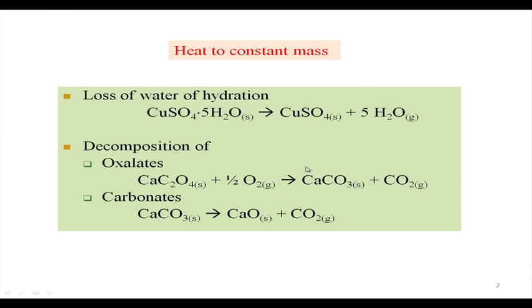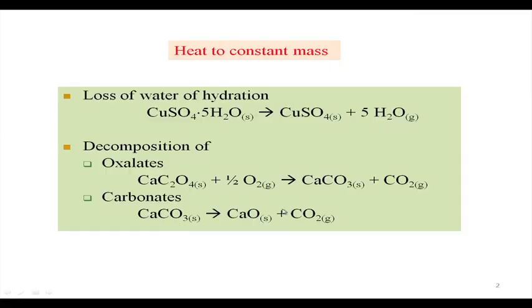This gives a very important piece of information to us, because in detail we will talk in our next class about the degradation not only of calcium oxalate, but of magnesium oxalate also, and that degradation process will also tell us about the stability of these two important compounds, because many bivalent metal ions can give you carbonates.